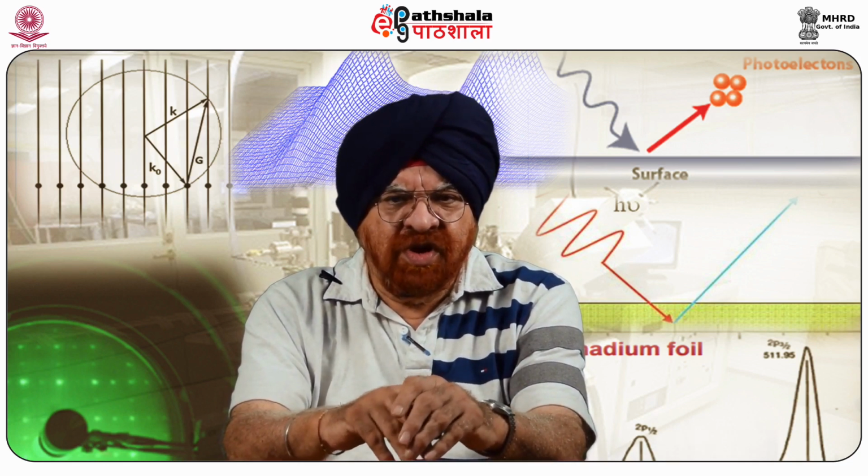Now, this works well when the background has been specially oversampled. The two are not mutually exclusive, and this is a very important point, and can be combined to give optimal results. They also ignore the distortions to the HREELS fine structures observed with PCA.